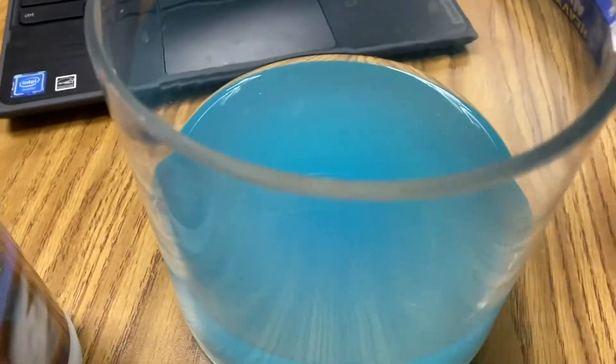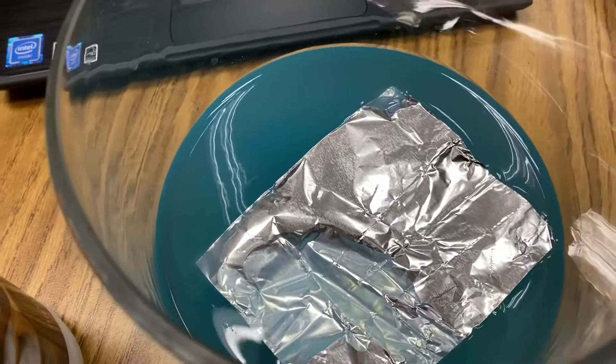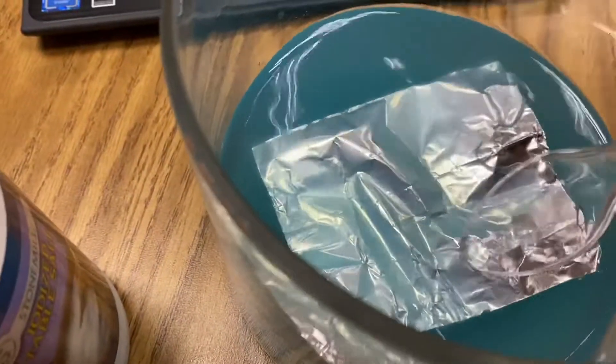So cut out a square of aluminum, put it on the surface, and at first you won't see anything happening, and that's because there's an oxide layer on the aluminum.